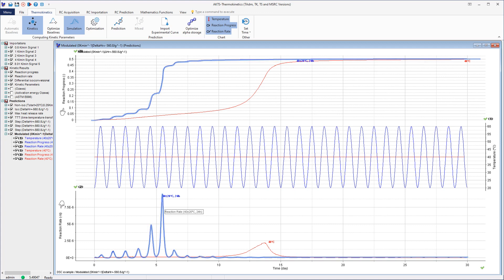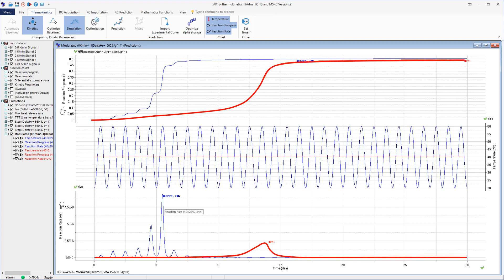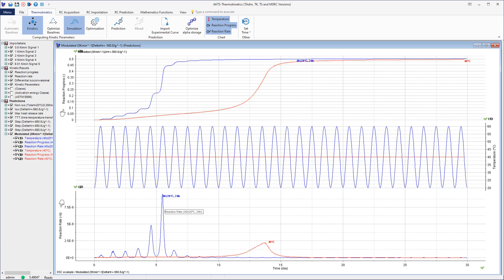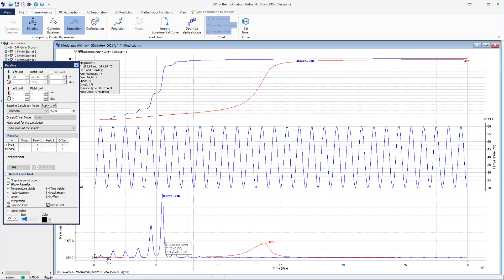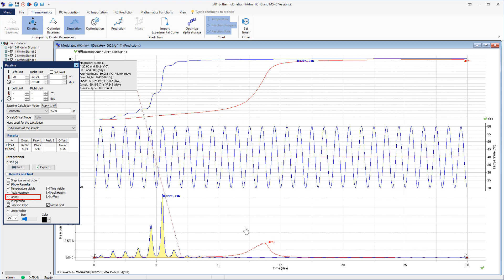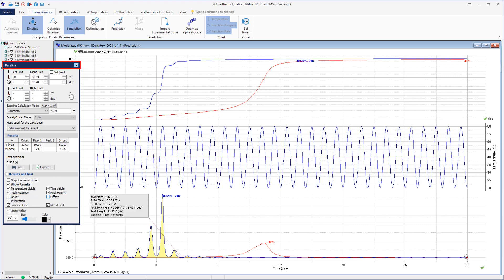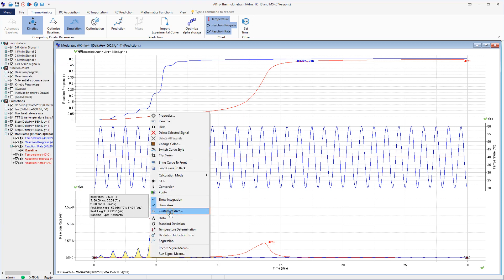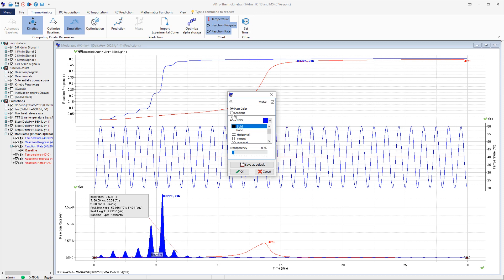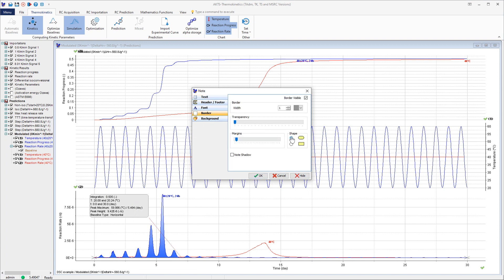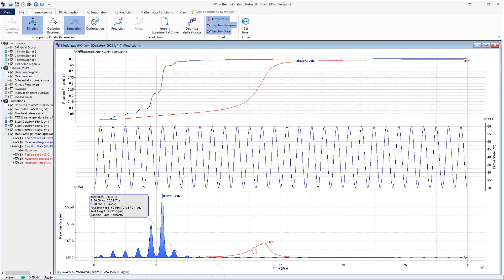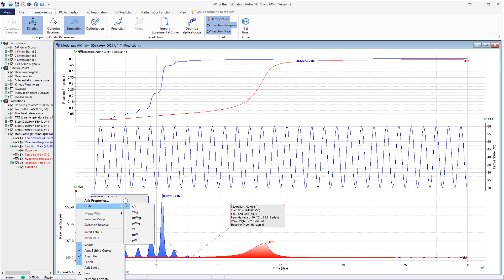The signals at modulated temperature are displayed in blue and at isothermal temperature in red. It is always possible to evaluate the heat flow signals as desired. The window allowing baseline construction is displayed after clicking on the reaction rate x-axis. The input of the left and right integration limits, either temperature or time, of the baseline can be specified. After clicking on Customize Area, the user can change the appearance of the displayed peaks. The appearance of the isothermal heat flow signal at 40 degrees Celsius can be customized similarly.